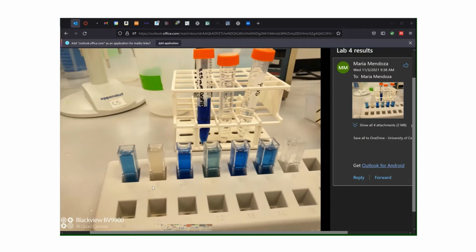So for your discussion, this is where you talk about what happened for each of these fractions. What did you observe, and what does it mean? So here in the homogeneous fraction, we wouldn't expect any succinate dehydrogenase activity, but it's light blue. There's actually some activity. In the nuclear fraction, we have a lot, like a lot.